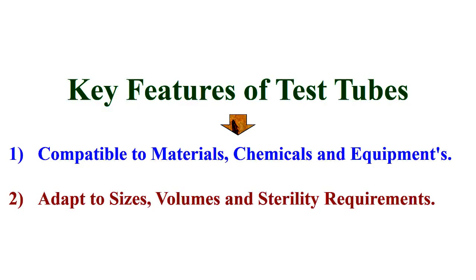Test tubes must be compatible with materials, chemicals, and equipment, and adapt to sizes, volumes, and sterility requirements, as mentioned in the next slide.